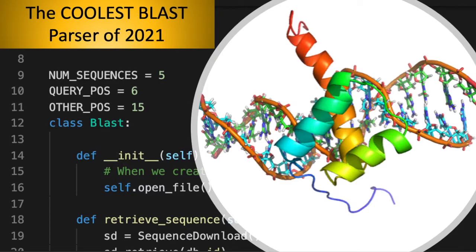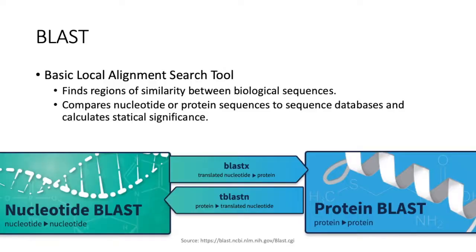My name is Sam and I'm excited to be here with you today to talk about the coolest BLAST parser of 2021. One of the questions that I get a lot from pre-health and health professional students is how do I actually use this coding stuff in what it is that I do. I wanted to show you this BLAST parser which directly uses Python programming to develop an effective biotech tool. So today we're going to be talking a little bit about the program and how to run it. If you're interested in seeing how it was coded, stay tuned because on Wednesday we'll release a video documenting the entire process of coding the BLAST parser.